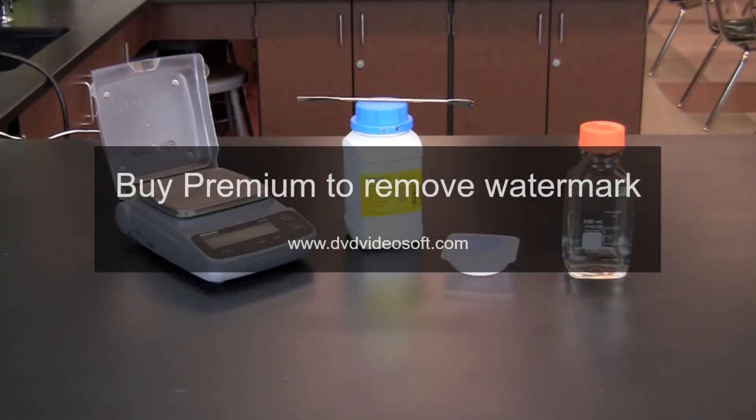Bacterial cell cultures require growth media. A common medium for culturing E. coli bacteria is lysogeny broth, also known as Luria-Bertani broth and commonly referred to as LB broth. In this video you will learn how to make LB agar with ampicillin and arabinose.